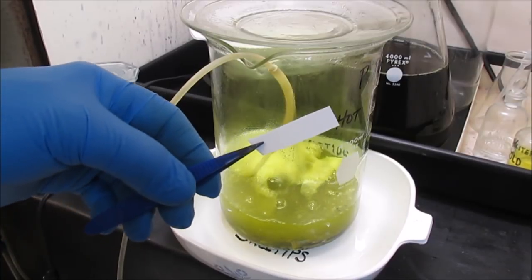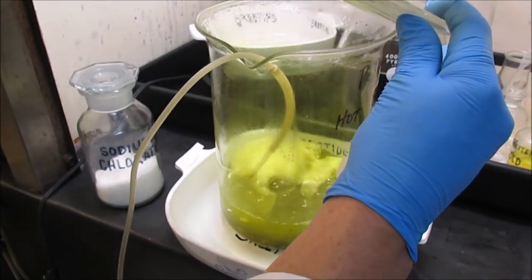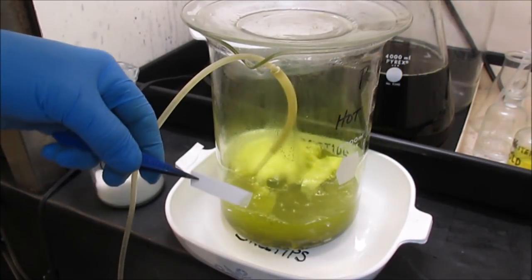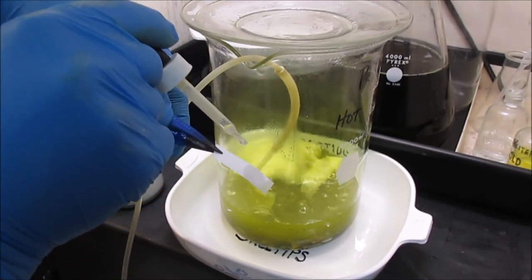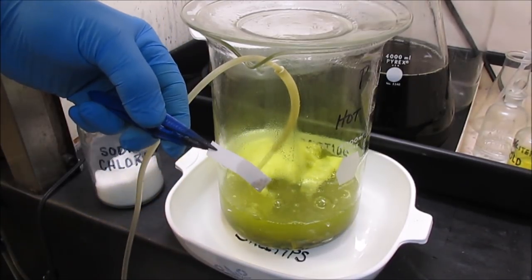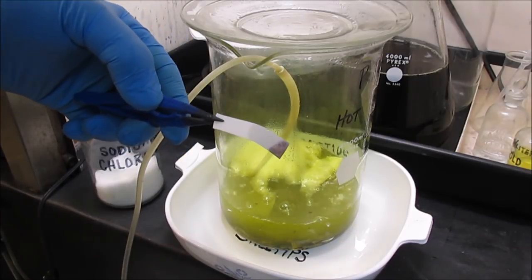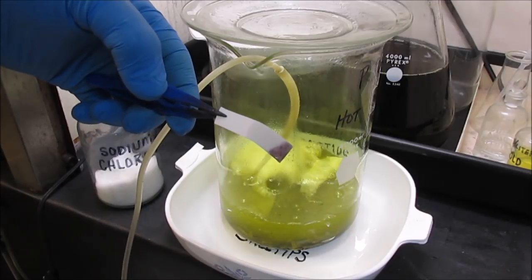I just added the sodium chlorate. I'm going to go ahead and take the lid off and stick this piece of filter paper down in there. Give me a little bit on the end of that. And then put some stannous chloride to see what we got here. Oh, get an immediate reaction. We've definitely got gold going into solution now. Nice.